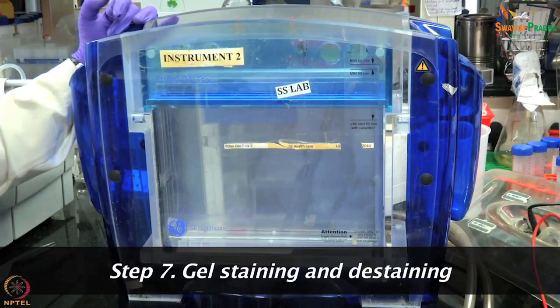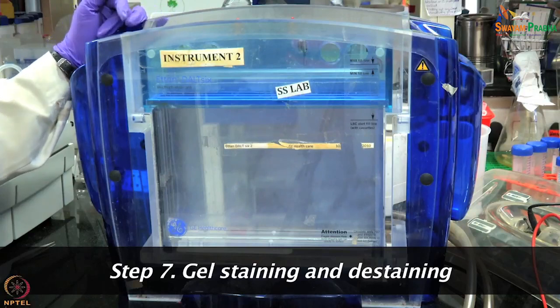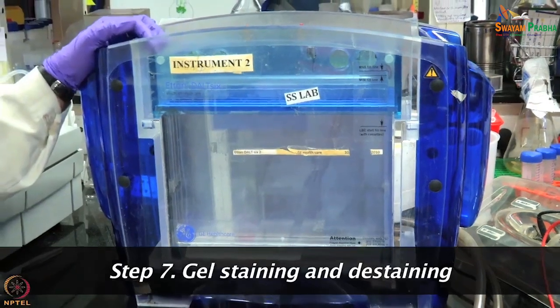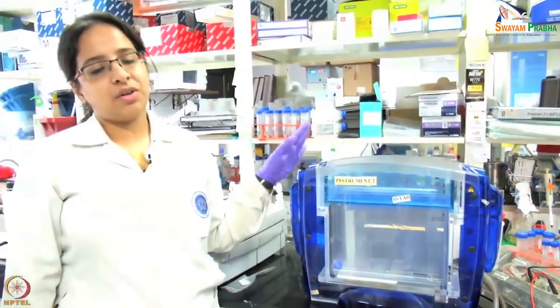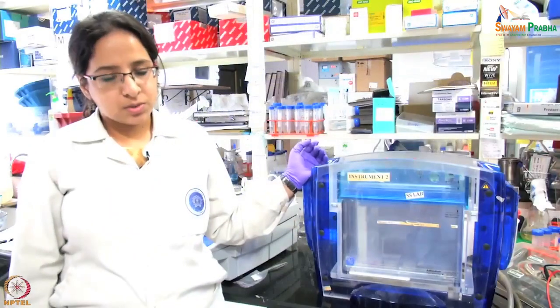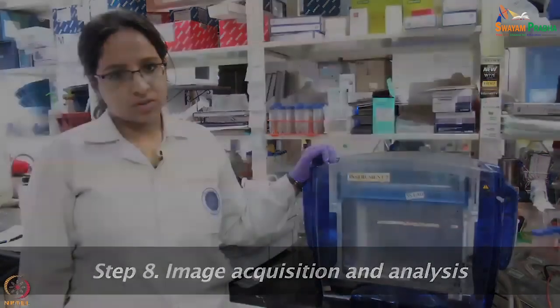stain our gel the way we do for normal SDS-PAGE gels. We'll then de-stain, and then this image is one of the representative images which you will see after you have de-stained your gel. You can see there are multiple spots on this image, and then later you have to annotate these spots using various software and identify your protein of interest.